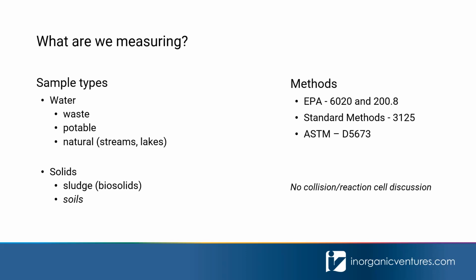The different methods, while we're kind of using EPA as a framework, there's a number of other different methods out there, standard methods 3125. And the ASTM method is actually under revision right now, and we are working with that ASTM committee to update that particular approach for environmental analyses as well.